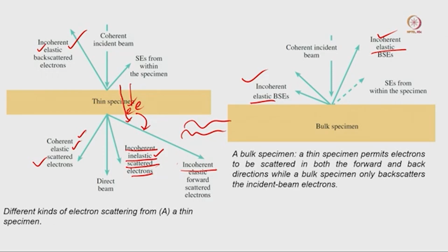As I mentioned, if your sample is very thick, or any kind of biological sample, it is not a shiny surface that will mostly reflect, and it cannot tolerate the electron beam for a long time. If it absorbs the beam, it will damage our sample. That is the reason we have to use a very small electron dose to keep all this soft material intact when we do the imaging.